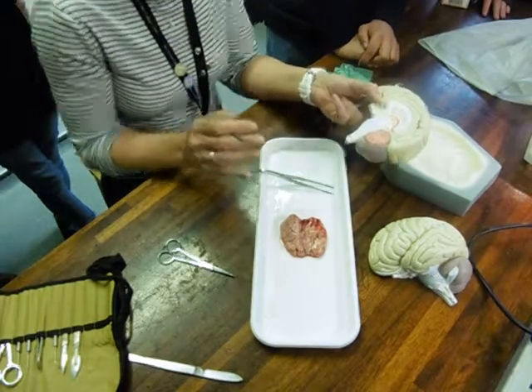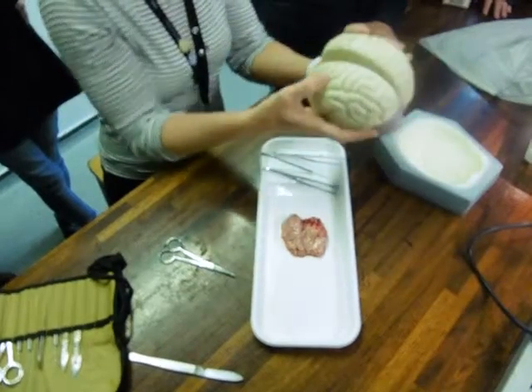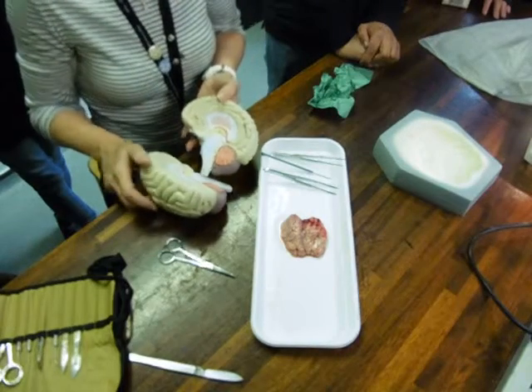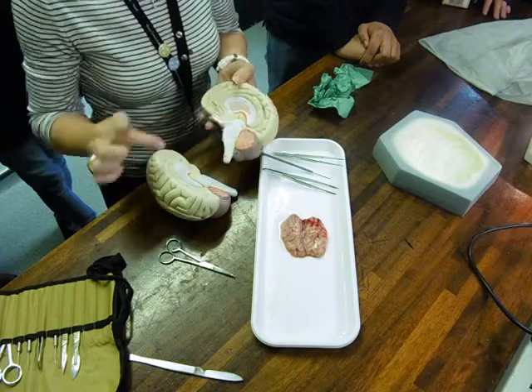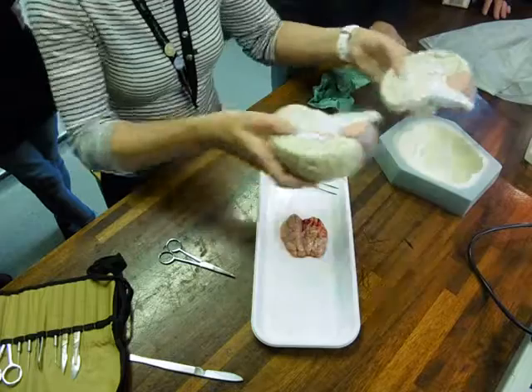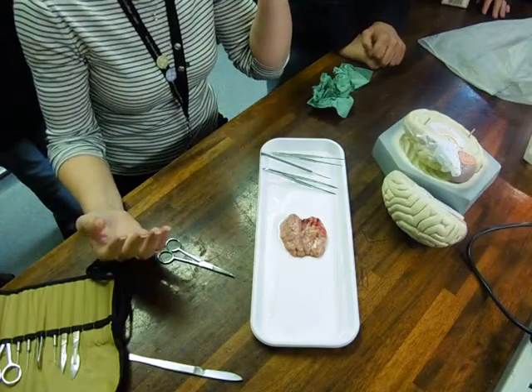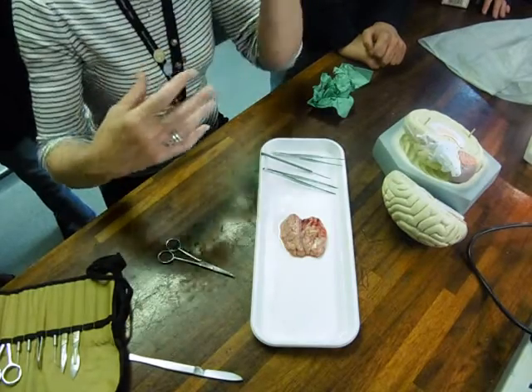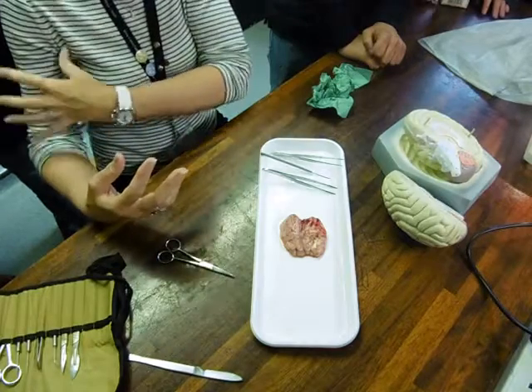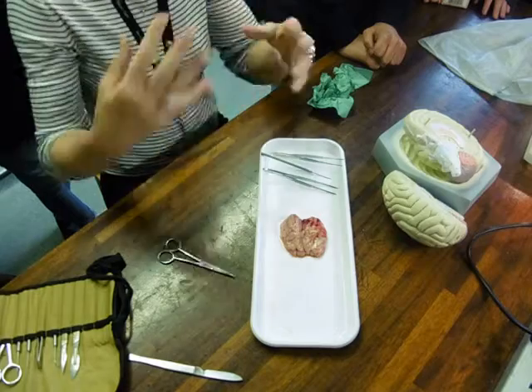I'm hoping that when we cut it open it'll look like that, but I don't think it will. Right? So, this is a lamb's brain, and the brain is separated into 2 main lobes like this, and it's joined together by some nerve fibres called the corpus callosum. And you've got slightly different functions for left and right. So you may know people who've had a stroke, and if the stroke's been on the left side of the brain, it's affected the speech and affected the movement in the opposite side. So you have functions on one side that affect the opposite side of the body, and the nerve fibres cross over in the middle.